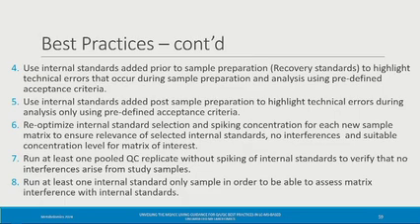That's the only comment I have. Yeah, so I think very valid comment. So I think that would work if you do your pooling before internal standard is added, right? If you do pooling after internal standard is added, then this would be a difficult requirement or suggestion to fulfill.